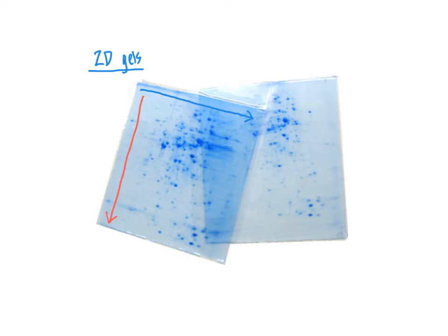And so there are a variety of different software programs that are available that once you take images of your 2D gels, the software will superimpose those for you to pinpoint which spots are separated between your treatment and control. This can get a bit dicey because it relies upon the methodology and the composition of the gel and composition of the samples being very analogous between the two different two-dimensional gels. So if one of the gels was applied to slightly a different voltage than the other, or some other condition differed just a small amount, then you could see variability from gel to gel that quite possibly could cause it to fail in the automated analysis.